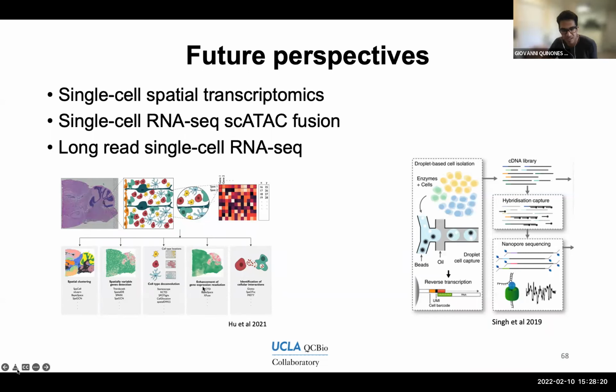What it's showing is that this technology is not single cell at the moment, but it's performing bulk RNA sequencing, while including some information about what part of the tissue this sample came from.